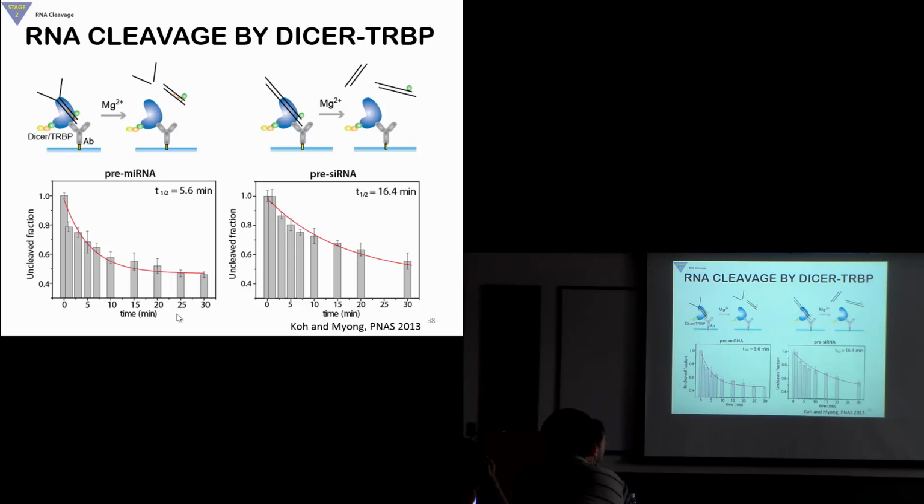Have you ever made proteins that would still have efficiency in lower or higher pHs? We did, and I have a faint memory, but it was a protein that we had to go down to pH 5. That was troublesome. So that's why, with 5, we try to stay above 6. 6 to 8 is fine. 8.5 is fine. That's a very practical question.